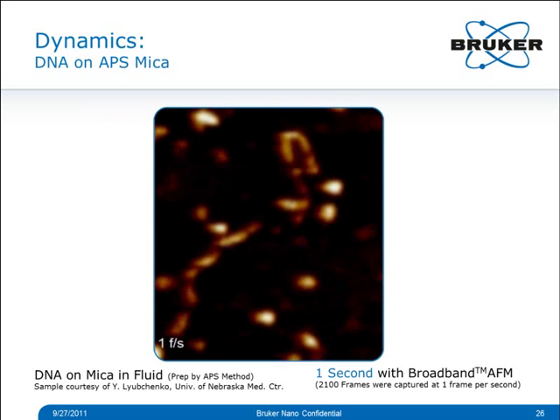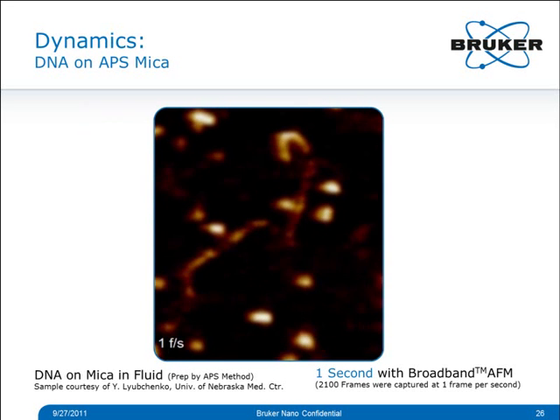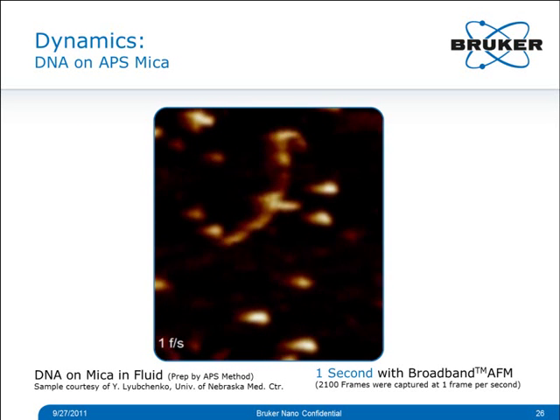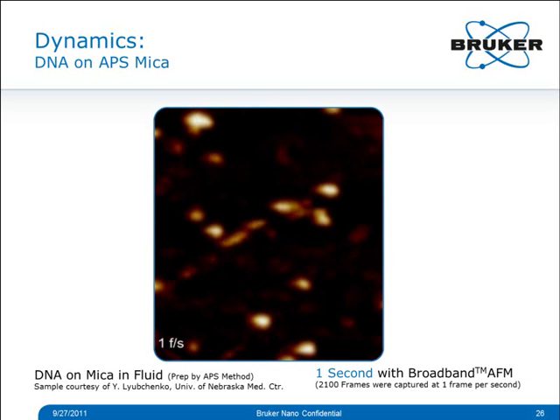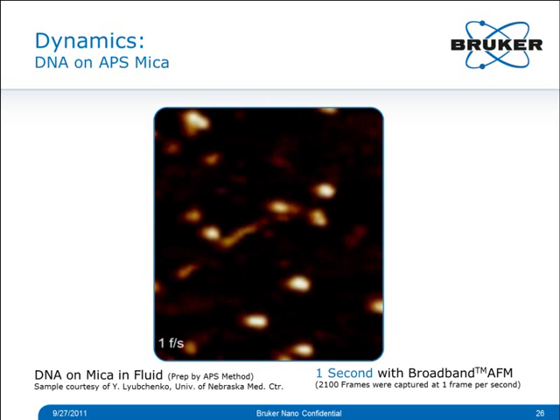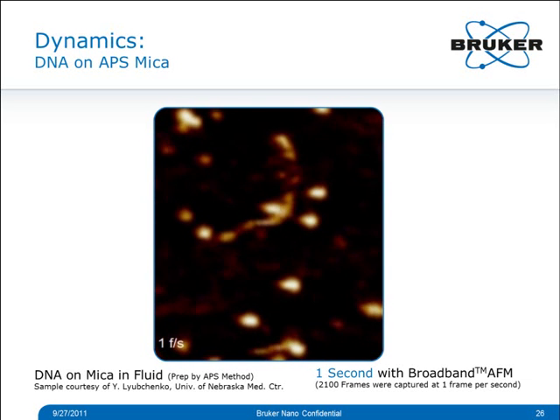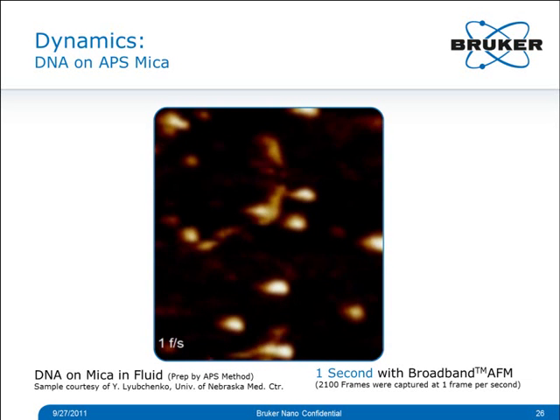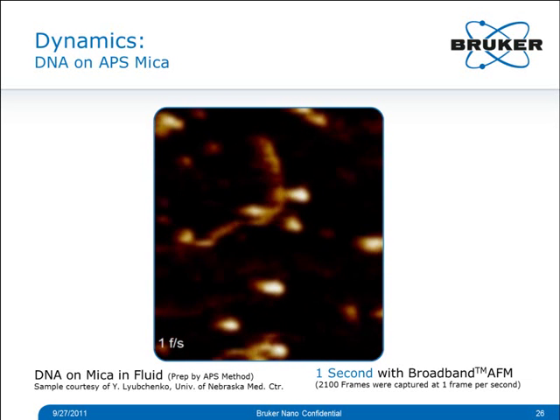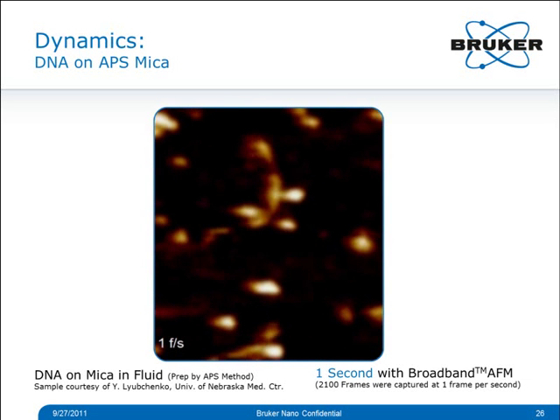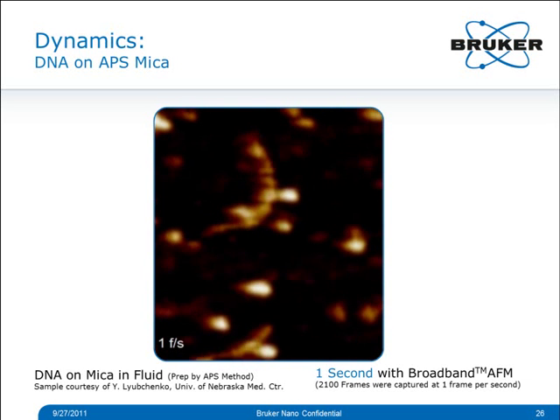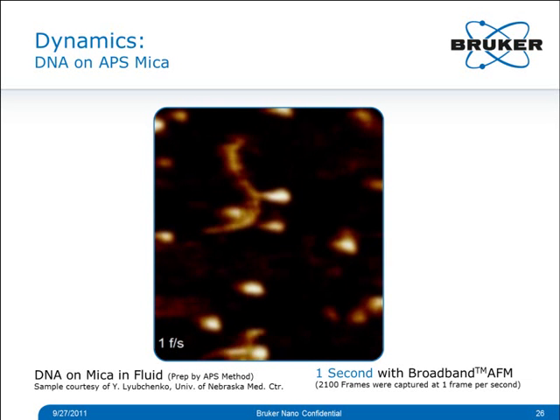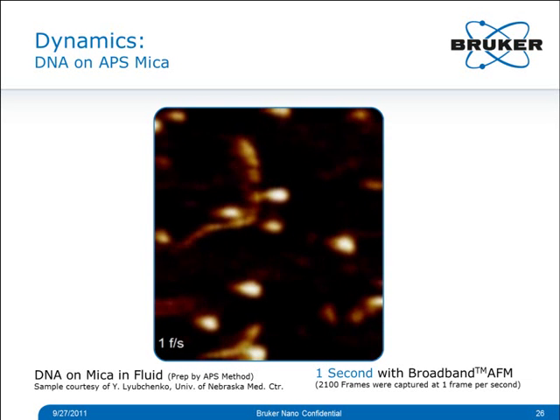Here is a dynamics example from probably the most classic area of high-speed AFM: single biomolecule dynamics. A movie of DNA loosely bound and diffusing on APS-treated mica was recorded at 1 frame per second, with a total of 2100 frames. The sample and substrate were provided by Yuri Lyubchenko at the University of Nebraska Medical Center.